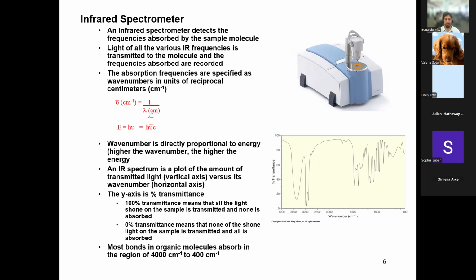And wave number, this is the formula for wave number over here. It's the inverse of the wavelength. Why did they decide to do it this way? I don't know. Look up the history of chemistry. I am noticing a trend nowadays where they are starting to just use absorption, so the spectra can be backwards instead of transmission. But regardless, the information is all the same.